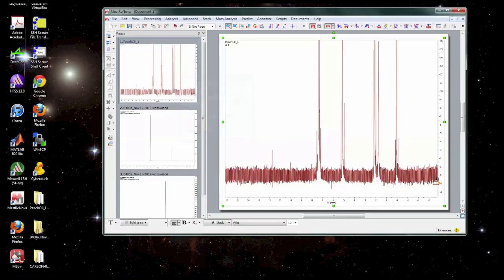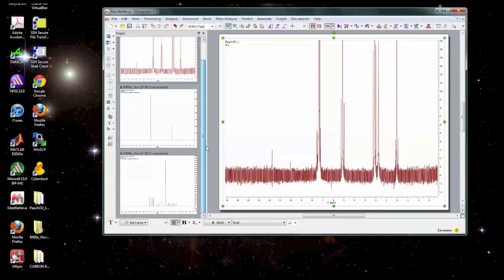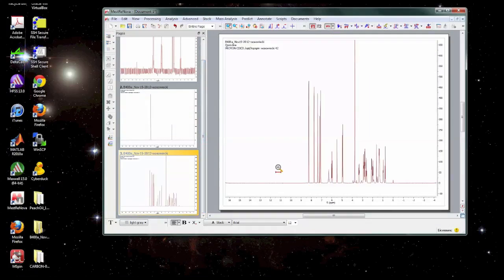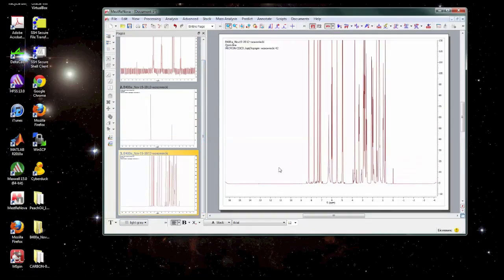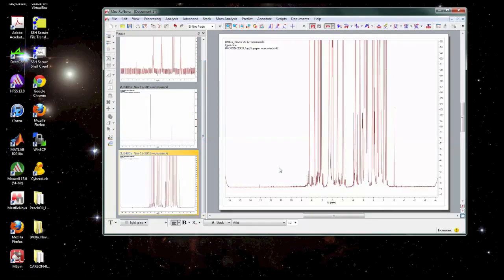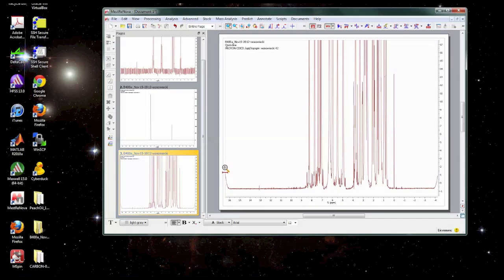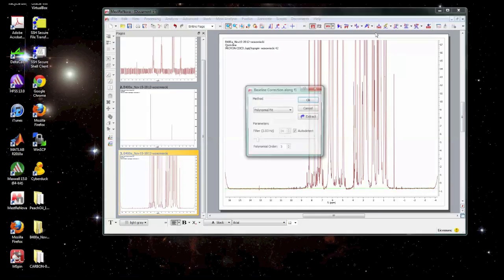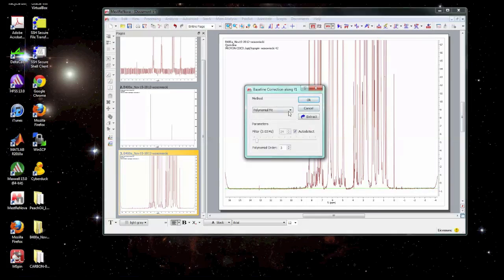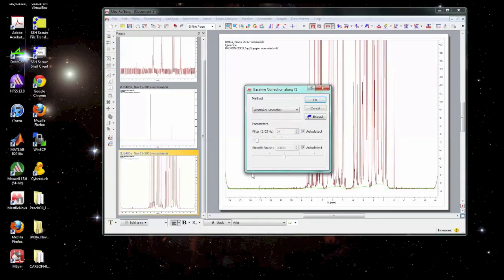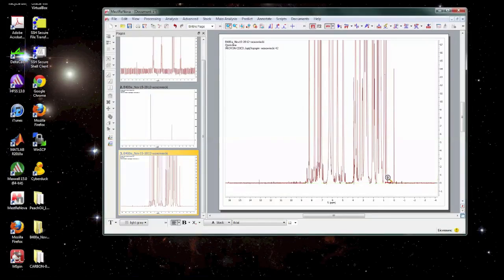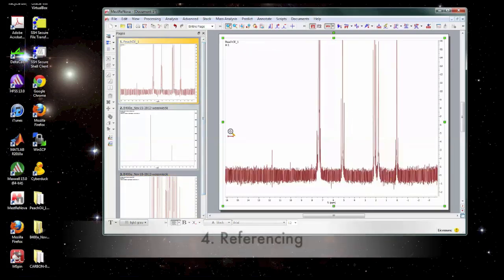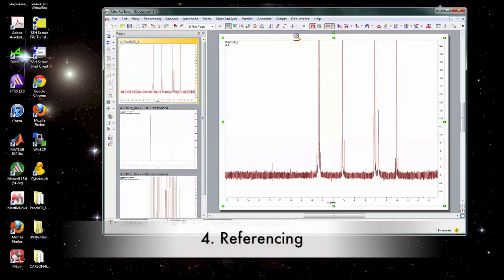Okay so we're going to use a regular third order polynomial with the auto detect filter and apply it. And what you can see is now that the baseline is centered at zero. And if there was any waviness in the baseline or some other imperfections, one that's very common on some instruments is something we refer to as a smile sometimes. You can see that the edges of the baseline go up. This is not real information. This has to do with the way that the data is filtered. So you can see that with this if we use something like the Whitaker smoother it will fit the edges of the smile and remove them from the dataset.